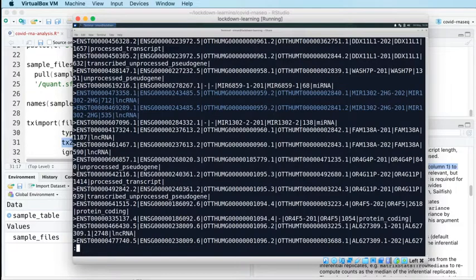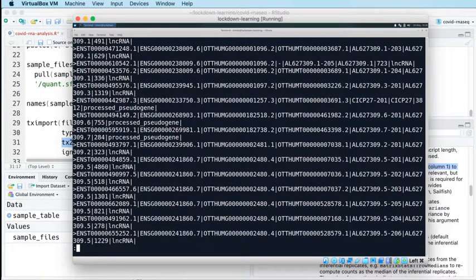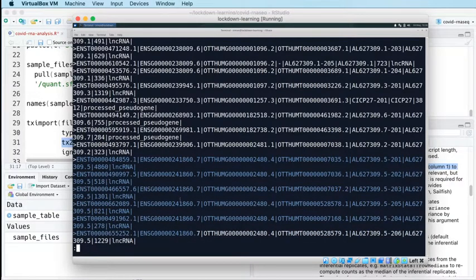And then if you scroll down this a bit, you will find genes that consist of more than two Ensembl transcript IDs. So this one, for instance, here, this gene. So these 6 lines all have the same gene identifier, but different transcript identifiers. So this gene is represented by at least 6 transcripts. So in order to get a gene level count for this gene, you have to sum up the expression for those 6 transcripts, or more if there are more.